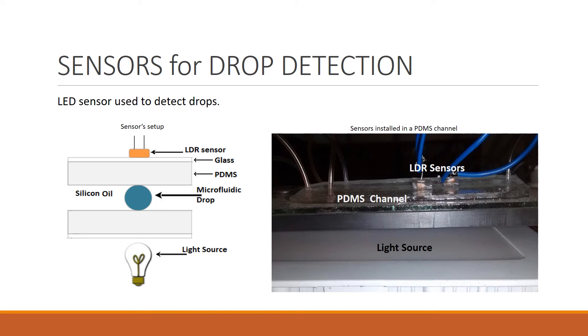Whenever a drop passes under the LDR, there is a change in intensity of light falling on the LDR, because of the difference in absorption, reflection and transmission coefficients of the two fluids used for droplet generation. This intensity change leads to resistance change of the LDR, which is related to the voltage signal of the sensor.